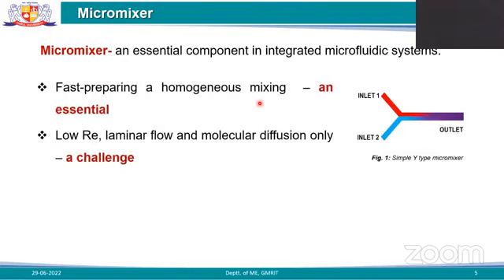In microfluidic devices, our requirement is very rapid mixing and uniform mixing. And we know that these fluidic devices run at very low Reynolds number, so the flow is basically laminar, and whatever mixing takes place is due only to molecular diffusion. So it becomes a very challenging task.